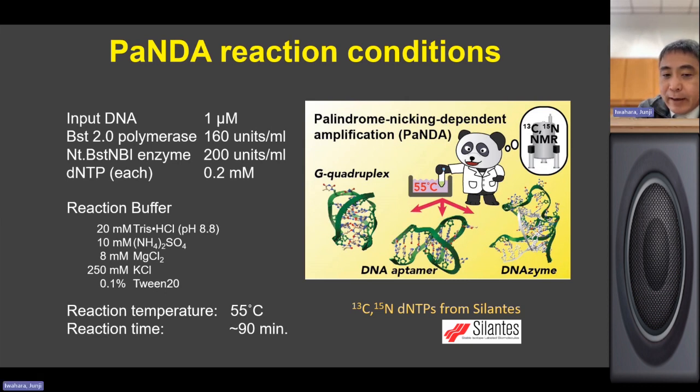But it might be possible to incorporate some unusual nucleotides depending on the fidelity of the enzyme. We just don't have any good information regarding that. I'm sorry.